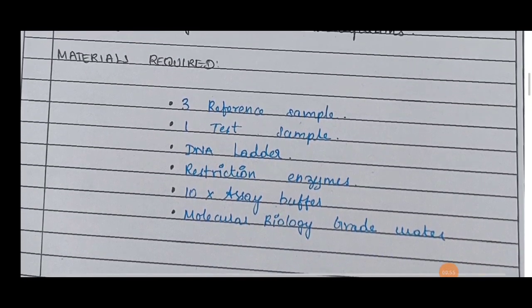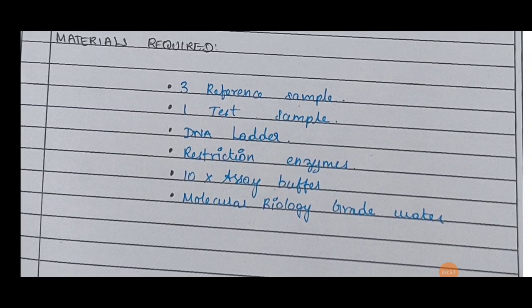Okay, then the materials required. Here I will describe the kit-based procedure. Three reference samples, that is 3 or 4 standard DNAs will be taken, and one test sample, that is one test DNA, is also taken. DNA ladder is standard, already given in the kit, and restriction enzymes are used in this procedure to cut the DNA, and 10x assay buffer is also used here, and molecular biology grade water. These are the materials required for RFLP.